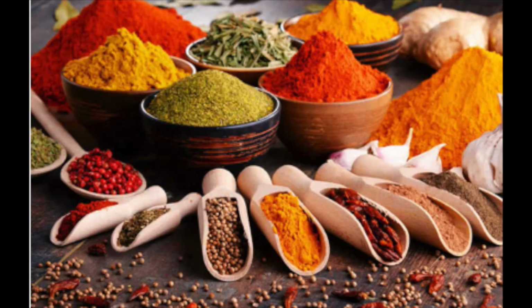In this lab, we will be working with fennel, cumin, cloves, cinnamon, caraway, allspice, and others as we isolate the essential oil from these spices. Okay, let's head to the lab.